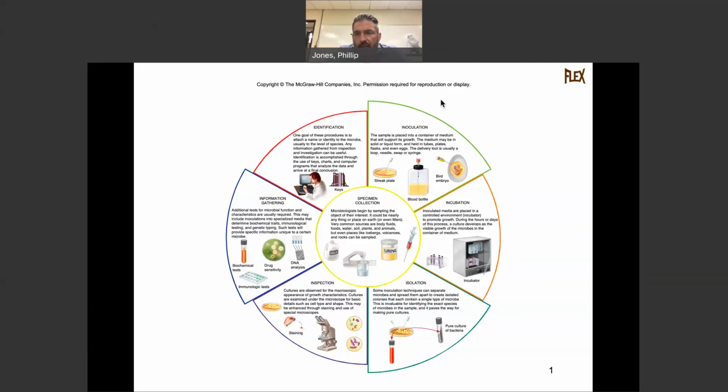Whether it's with differential broth tubes, gram staining, we can check drug sensitivity, which we'll be doing. We could do DNA analysis, which is probably the most accurate and quickest. They analyze it with the little DNA tubes that come in a row. You swab it, and whatever has the antigen antibody reaction, sometimes there's a way of doing that. Or we just check the DNA. They'll tell us pretty close exactly what it is, and then identify it.